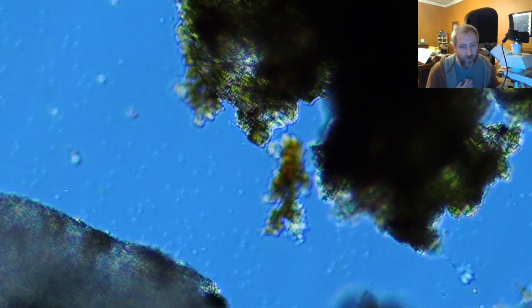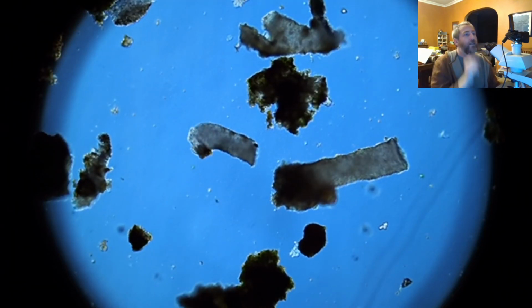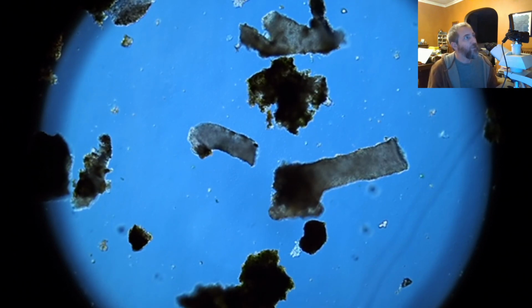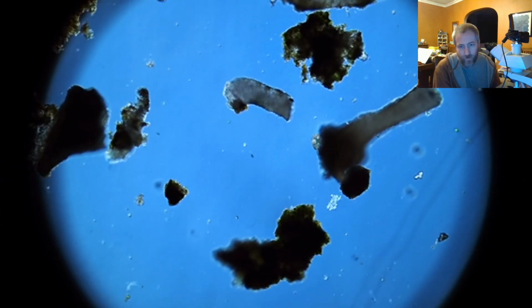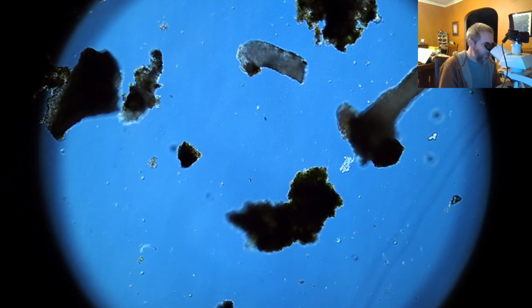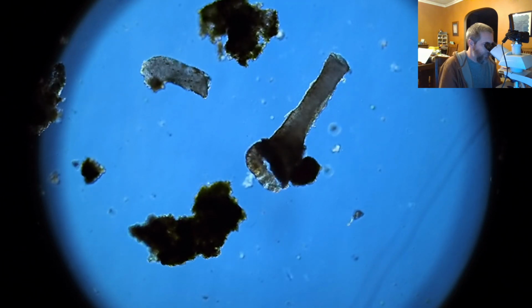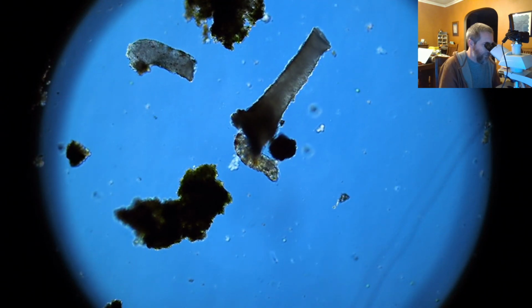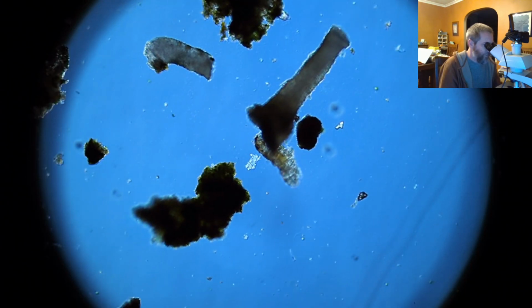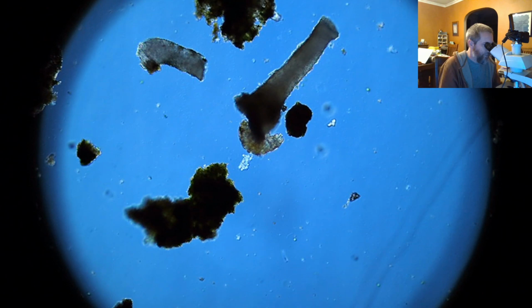After about a week, I would come back and put the water bears on a slide, and they would be, for the most part, inactive, even with the water. Even with the water part always wet, so that they weren't ever dried out. They were just laying around, and I don't know if they sleep or they can only be active for so many days in a row before they slow down. Didn't really do any research on it.